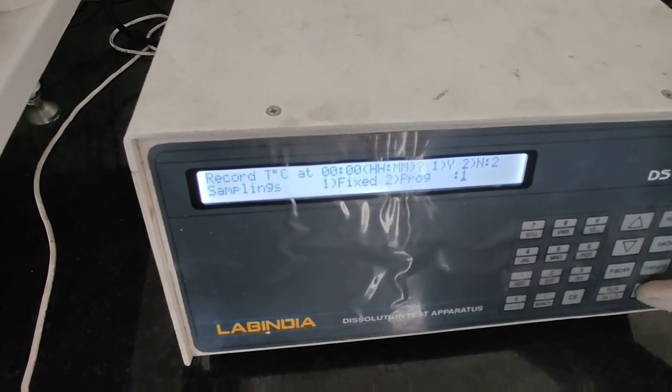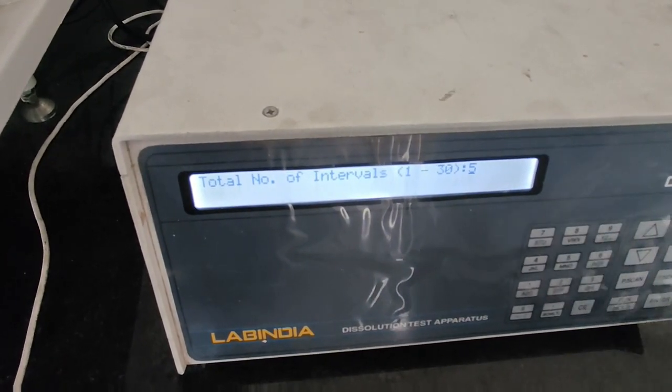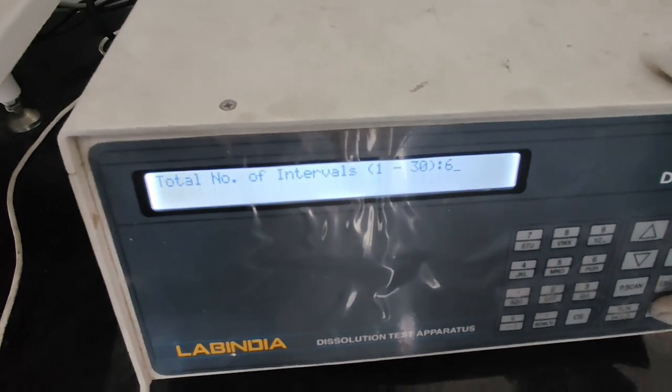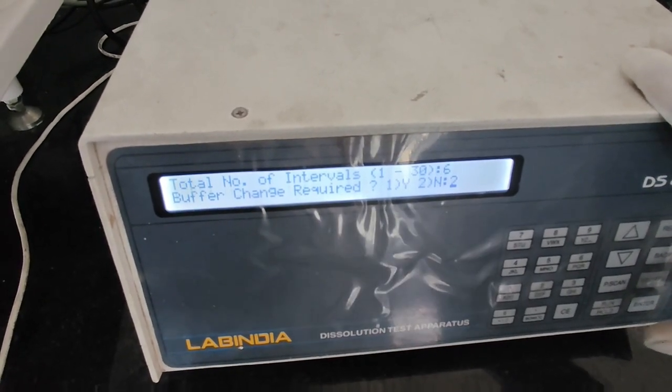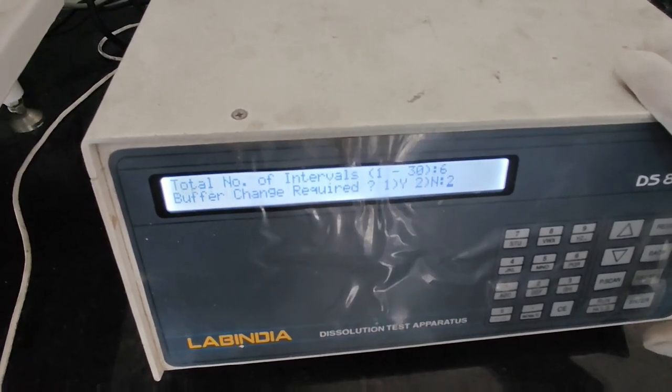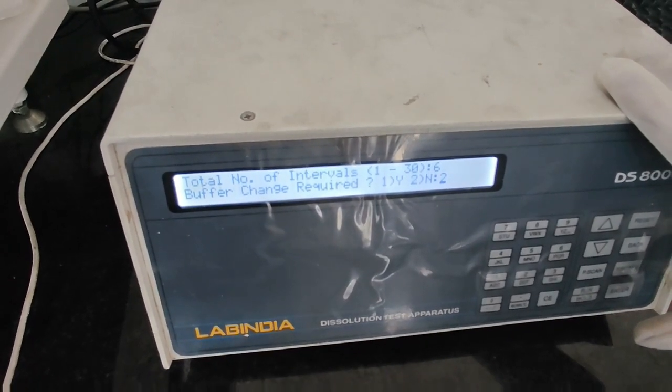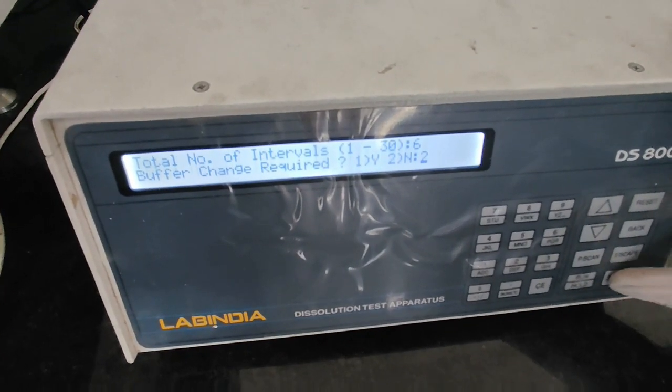Then samplings are already fixed. Then total number of intervals: how many intervals you want to take. For example, I want to take 6 intervals. I will enter it, then press enter. Then buffer change is required. For paracetamol, no buffer change is required. I am doing it in distilled water. In case of enteric-coated tablets, buffer change is required. In that case, you may select yes. But in my case, it is no. So I will press enter.